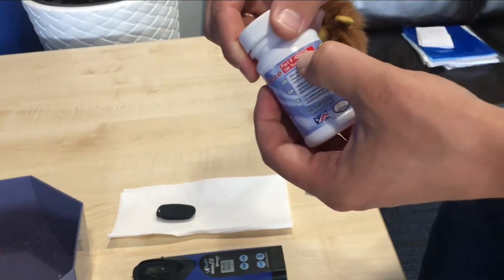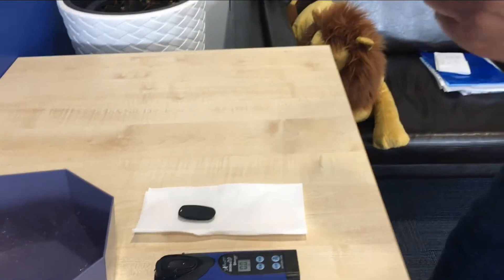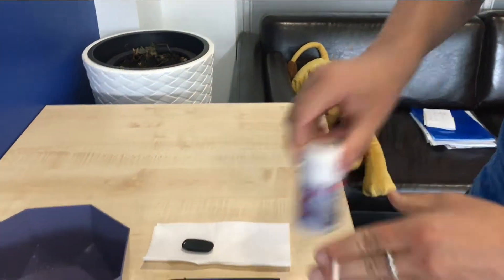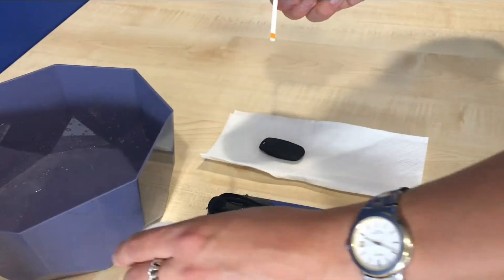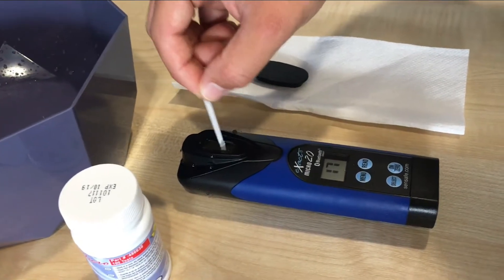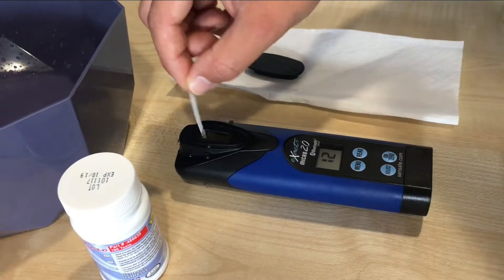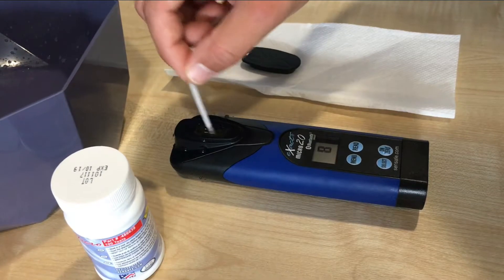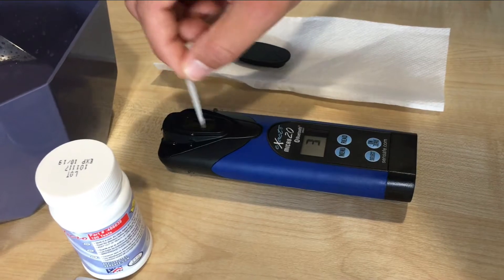We take the reagent — part number 486639, just like it says in the instructions. We take out one strip and press read, which gives a 20-second countdown. During these 20 seconds, we move the strip back and forth at about two strokes per second so the reagent is released into the water.